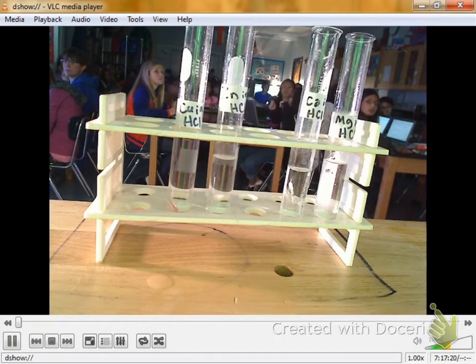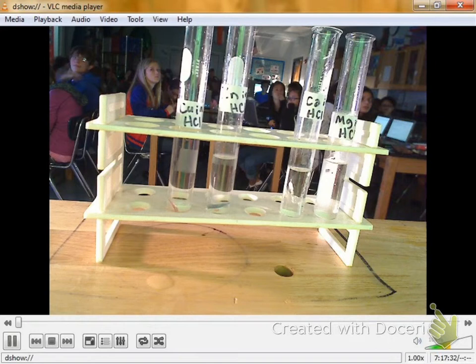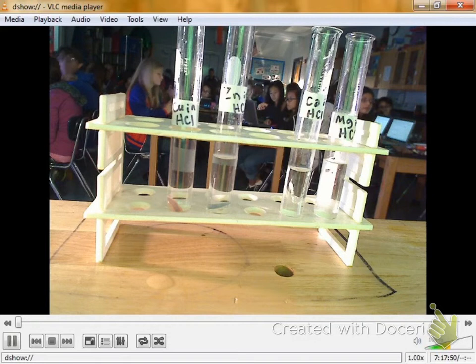Here is zinc. In my class, I left off the hydrochloric acid one so you don't get too excited here. Just watch. All right, so now I did zinc and hydrochloric acid. Again, where did it go? It sank. We're not seeing any bubbles forming. We're not getting any color changes. No, there's not a temperature change. It's just not even exciting at all, is it? Back there, Xander's like, oh my goodness, it's Christmas. Come on, move on to the good stuff. Don't blame you, Xander.